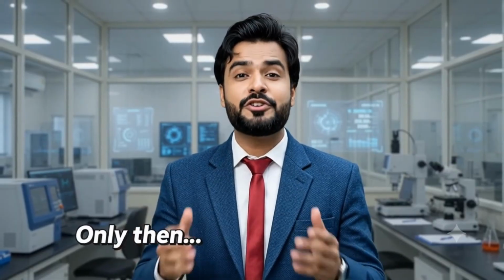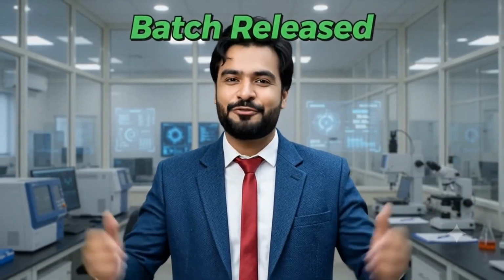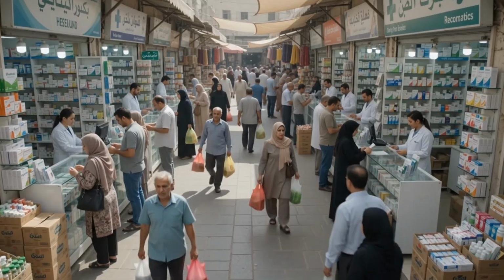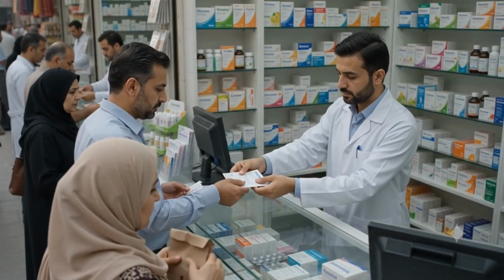Let's look at batch release. If all QC testing meets specifications, the Quality Assurance Department reviews the complete documentation. Only then, the batch is released for distribution. Without QC approval, no pharmaceutical product can legally enter the market. Every medicine you purchase has passed through this rigorous process.